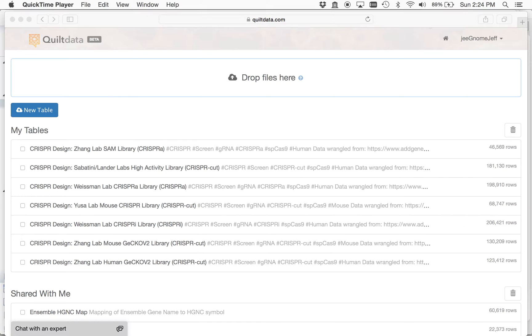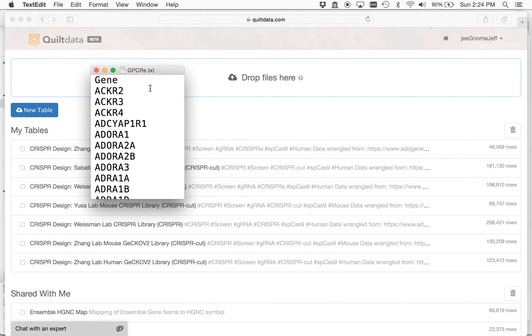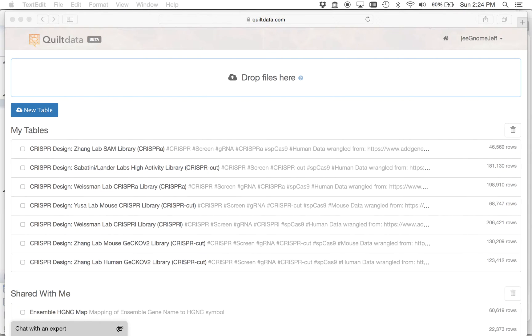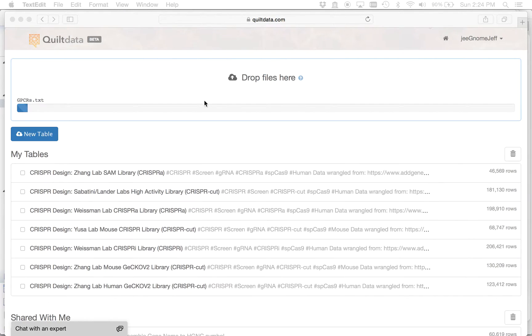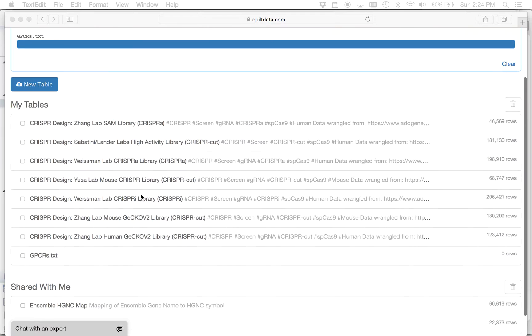So I start first with my gene list, and here I've taken a list of all the G-protein-coupled receptors in the human genome, there's a little over 700 of these. I start with this gene list and can just drag and drop the file right into Quilt here, and this will load up onto my home page.